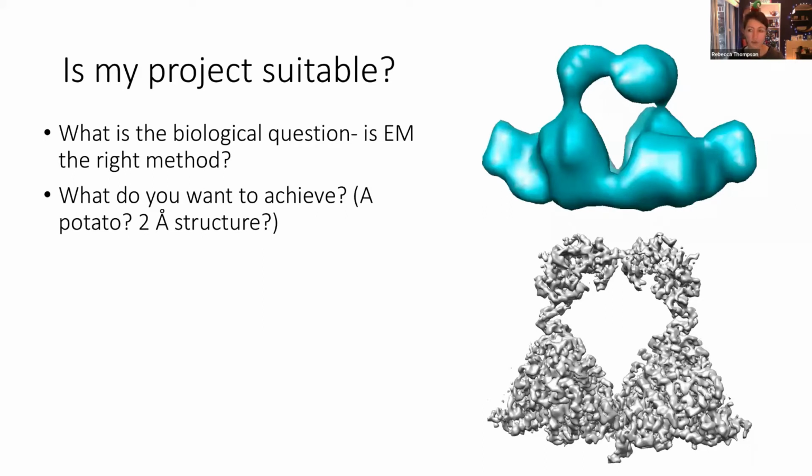Whereas if, for example, you're looking at small molecule binding, then you would need a much higher resolution to be able to achieve that. So it's always worth starting at the beginning and thinking, what resolution do you need to achieve?